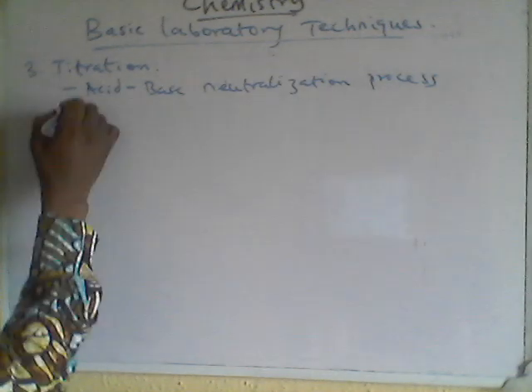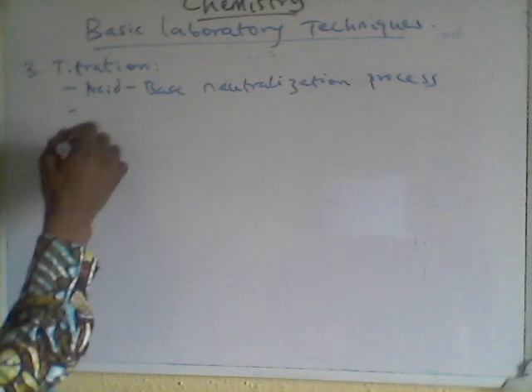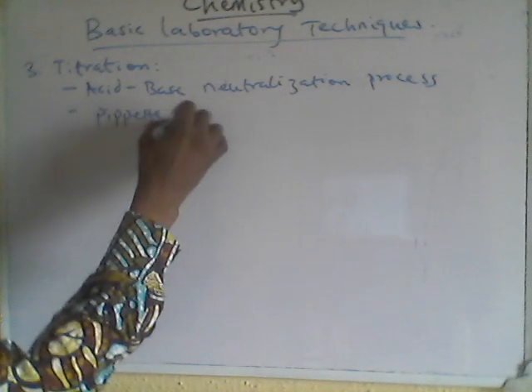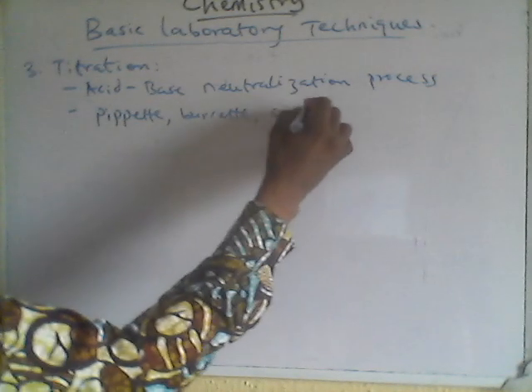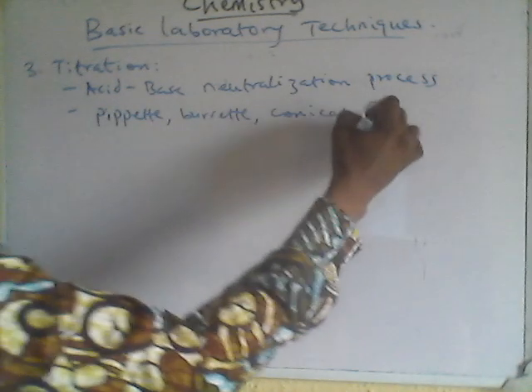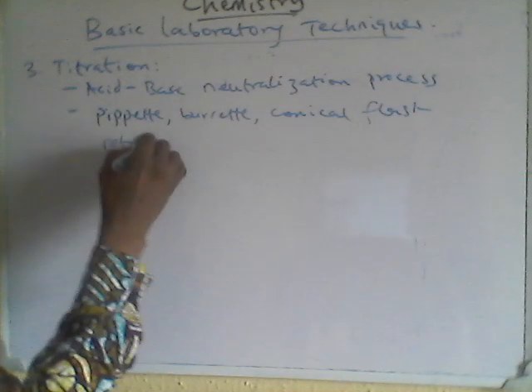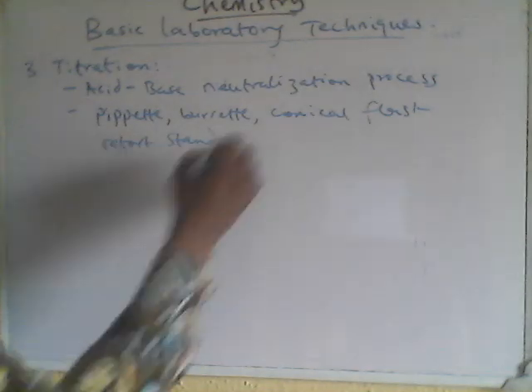It also involves the use of pipettes, burettes, conical flasks, retort stand, and the indicator.